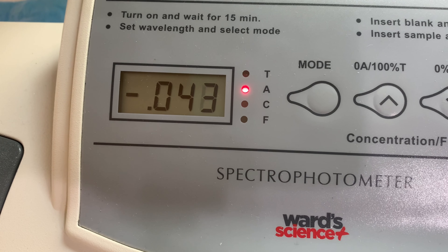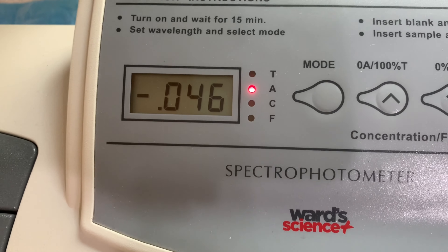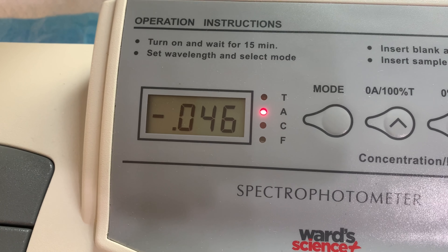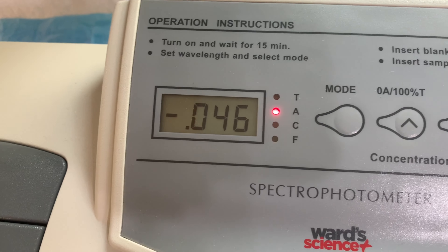Just push the holder in and copy down the numbers — there's your reading, and there's another sample. By the way, if you ever get negative readings, it's because your sample doesn't have enough solutes to absorb the light. In other words, you're getting 100% transmittance, and that shows up as a negative value when you're in absorbance mode.